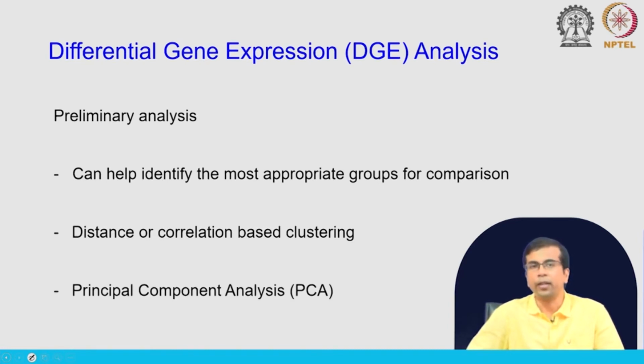And then we have another method which is called the principal component analysis, or PCA. Again the idea is very similar. We want to look into the samples that are similar to each other and the samples that are different from each other.